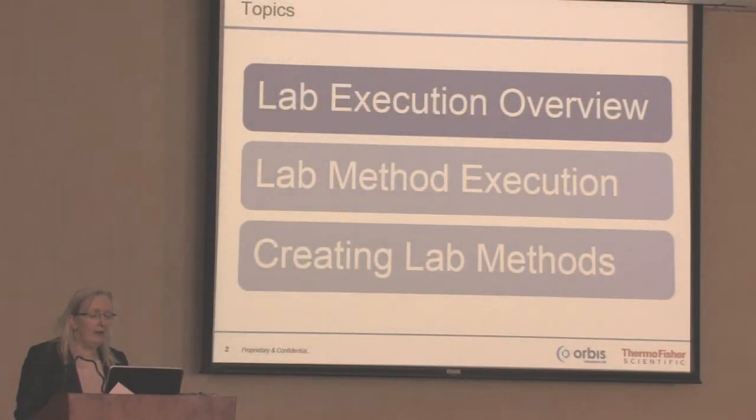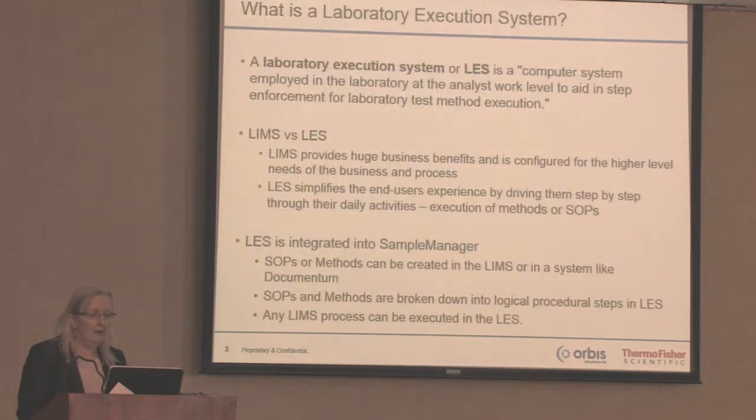Okay, so with the overview of the execution system, there's just definitions of what a laboratory execution system is. The idea is that the LES will help to drive the methods in the lab, help to enforce the method so that everybody will be using the same method, same steps.